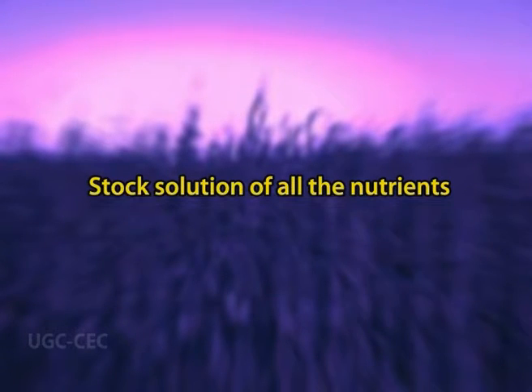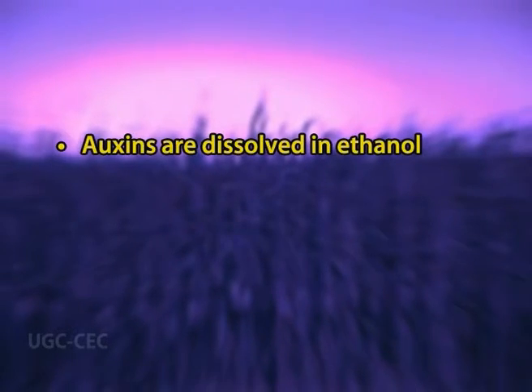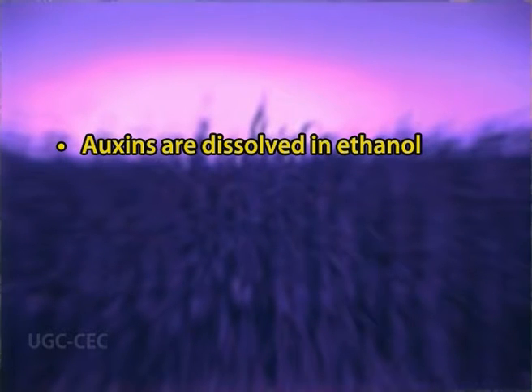Stock solution of all the nutrients is prepared. Media is prepared by suitably diluting the appropriate amount of stock solutions for desirable volume of medium. Auxins are dissolved in ethanol.